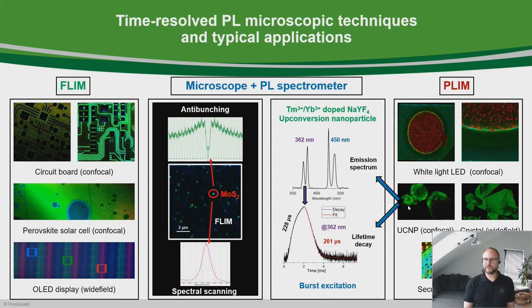It is a so-called new material. It's a highly promising material. It's a TMD, transition metal dichalcogenides. So there are different types of material in this group, and those form flakes. And you have to check if it's a single flake or a few stacked flakes.